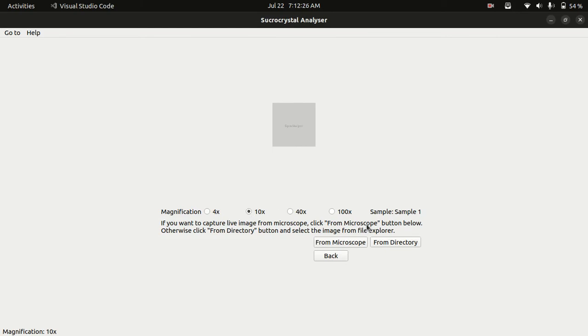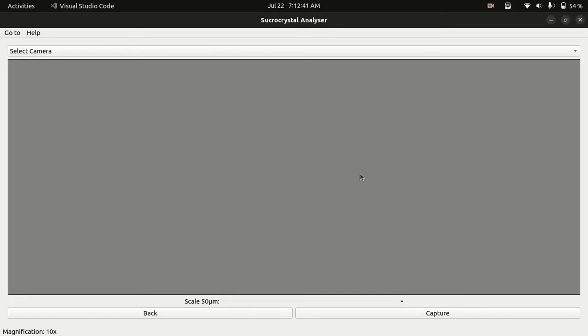Under this I have two more options: from microscope or from directory. If you have a USB microscope you can attach directly to your system and analyze it. Otherwise you can select an image from directory. So let's see the microscope first.